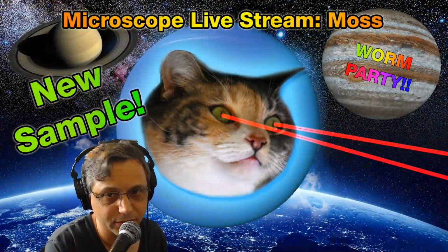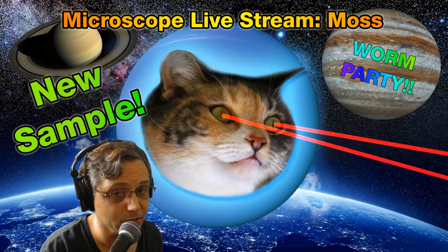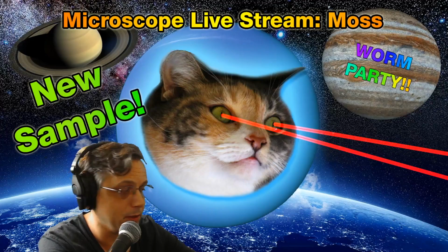Wherever fungus is growing. Haven't really found a lot of fungus or lichens for that matter, which is one of the things that we're looking for. Because the lichens is one of the places that I'm pretty sure tardigrades live on. So, yeah.